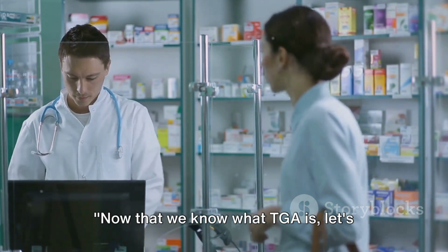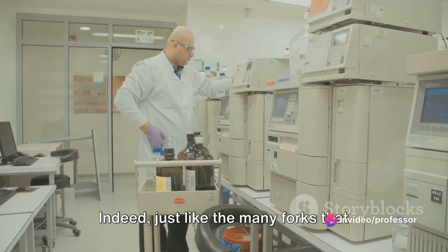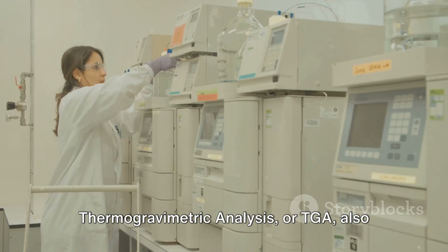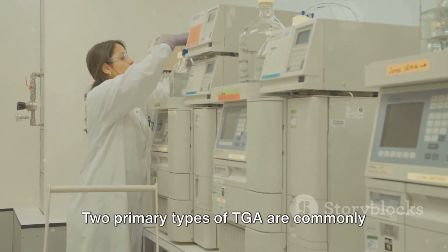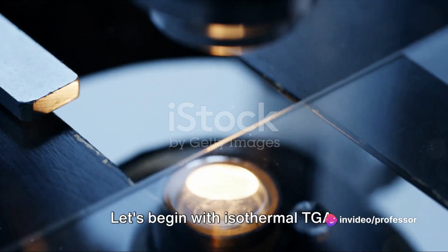Now that we know what TGA is, let's delve deeper into its types. There's more than one way to conduct thermogravimetric analysis. Indeed, just like the many forks that lead to fascinating discoveries in the path of scientific exploration, thermogravimetric analysis, or TGA, also presents us with different avenues. Two primary types of TGA are commonly employed: isothermal and dynamic. Let's begin with isothermal TGA.